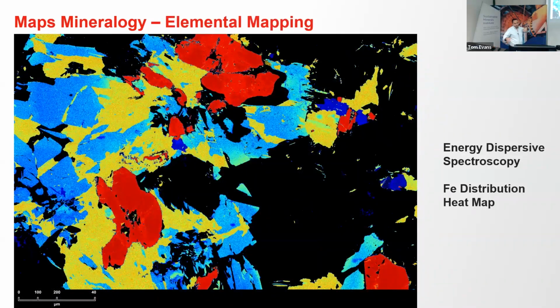And this is how we present the images. For example, you can present them as a heat map, very similar to a microprobe type of visualization, where you can select a particular element and visualize it as a heat map. This is using the relative concentration method when you visualize them. So the areas in blue are the ones with low concentration. The areas in red are higher concentration. We're working with quite a few researchers at UQ. They have incorporated some of these images. Some of them might look a little bit familiar.